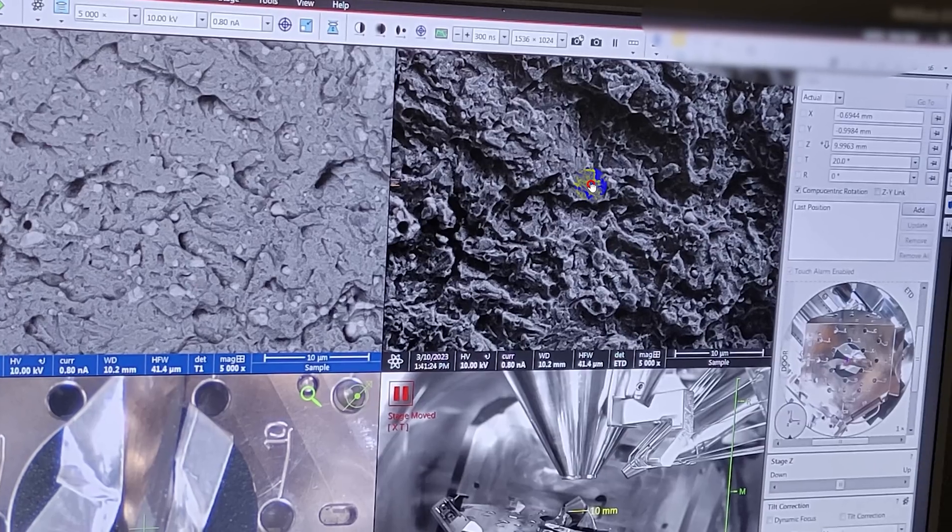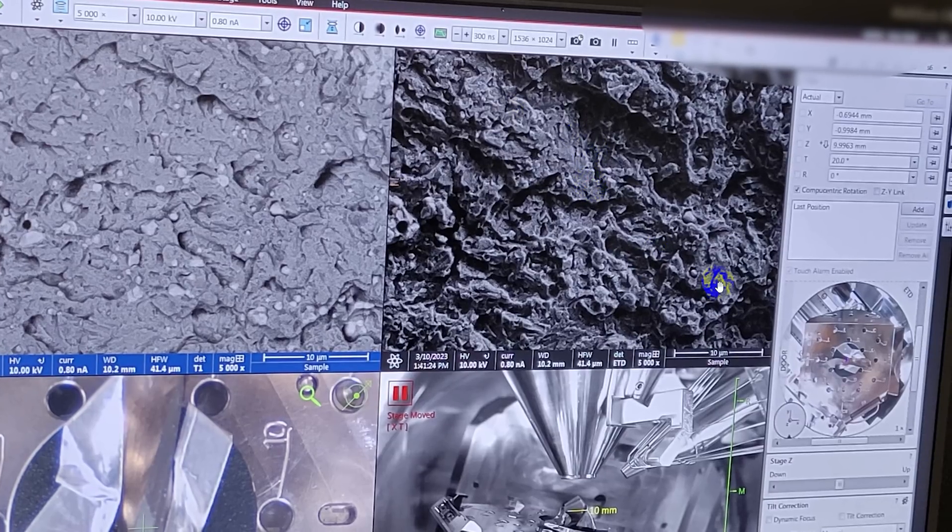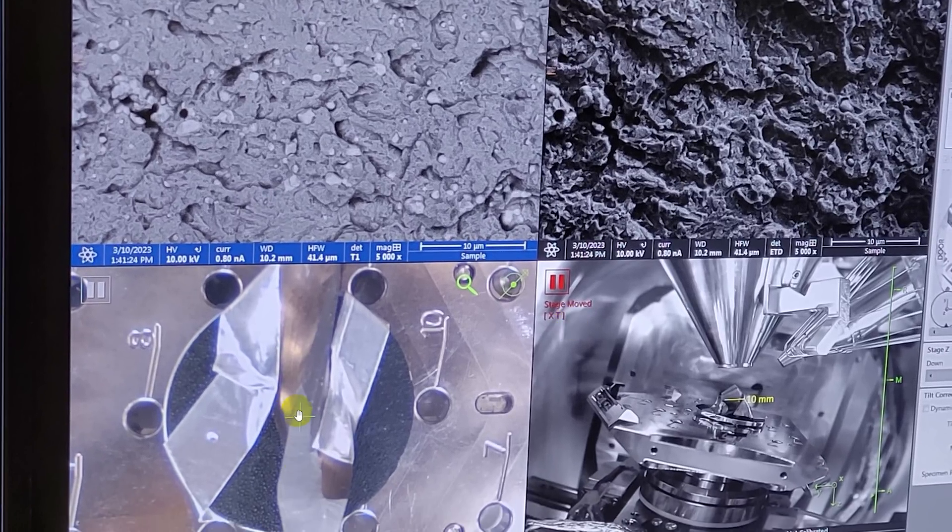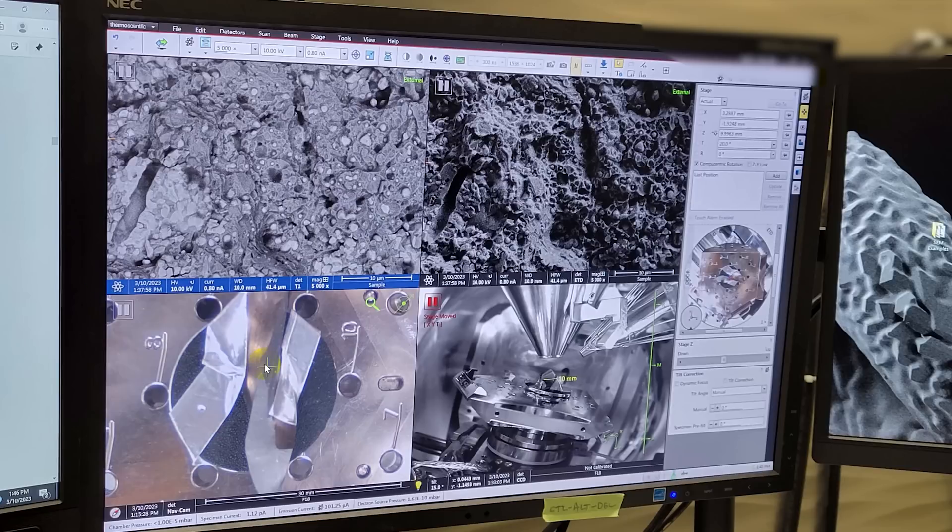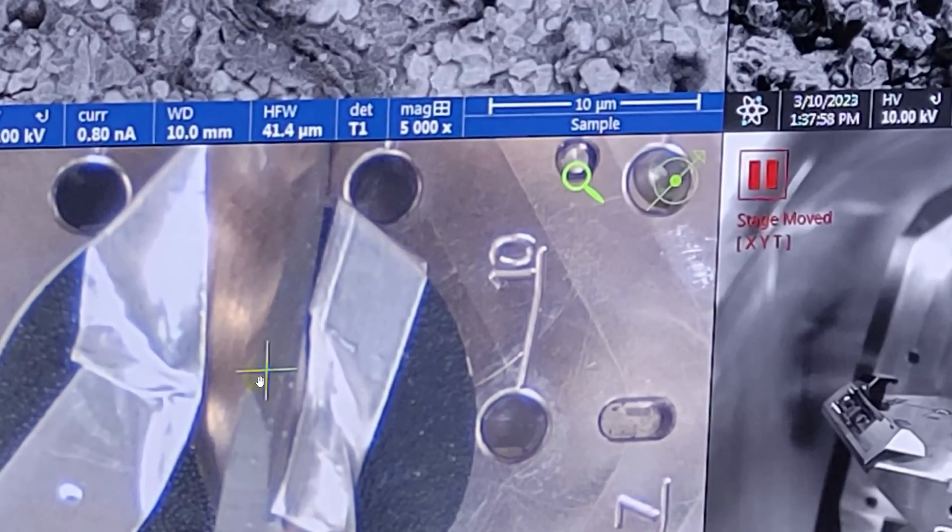Now when you look at this sample, the morphology of it or the shape of the break tells you some things about it. You'll note there are lots of little facets here and there's not a lot of stretching or pulling. There's not a lot of rounded surfaces. There's not a lot of cupping here. This looks like this material was broken between the grains, and that is characteristic of a brittle failure, meaning that the material was hard when this was broken and the break and the failure was sudden. It propagated through the material. There wasn't any stretching or giving of the material. It just fractured. And that is consistent with the hypothesis that this part of the material was solid. The material is very hard. This is a cutting tool and it fractured while it was cutting.